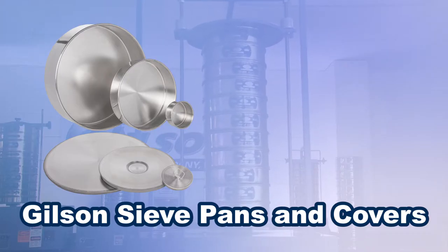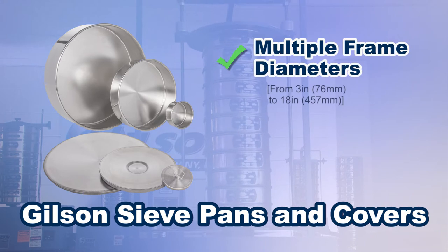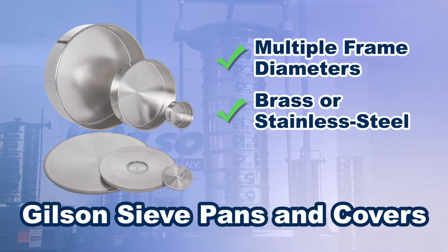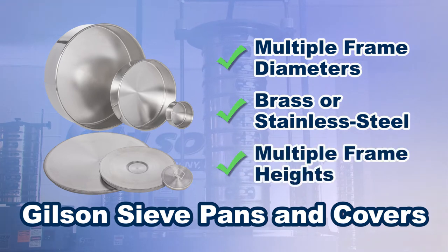Gilson's extensive selection of sieve pans and covers comes in a wide range of sizes, and in either brass or stainless steel, with pans in half height, full height, or intermediate height.